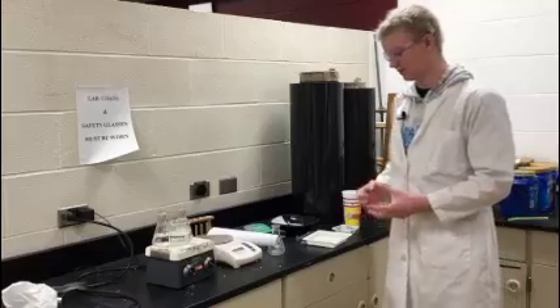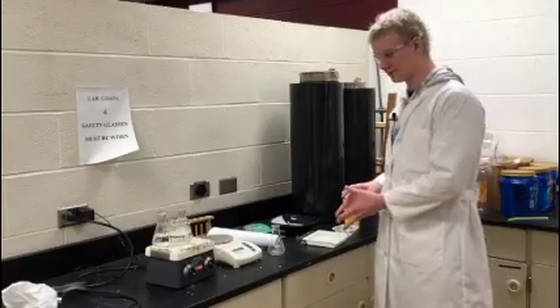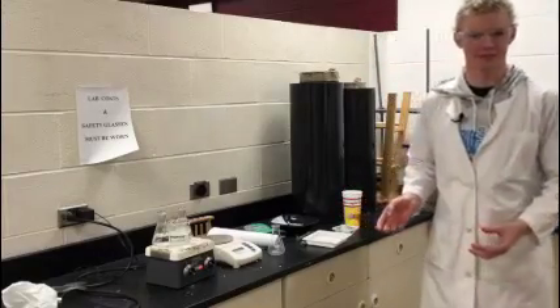The form that you're going to be testing are pellets. Our pellets have been conditioned for 24 hours in our oven at 50 degrees Celsius.